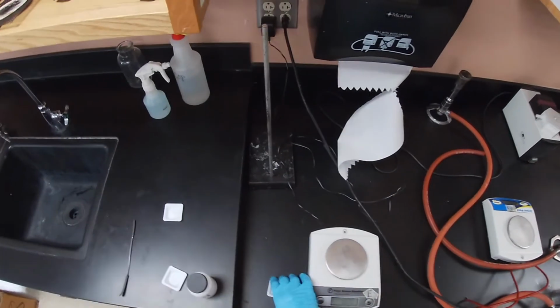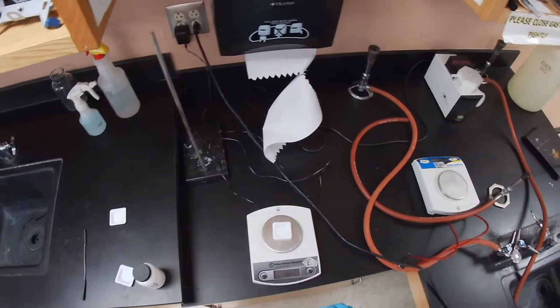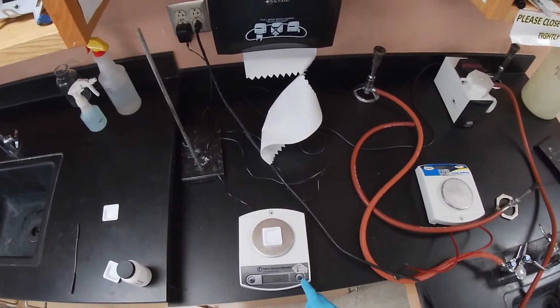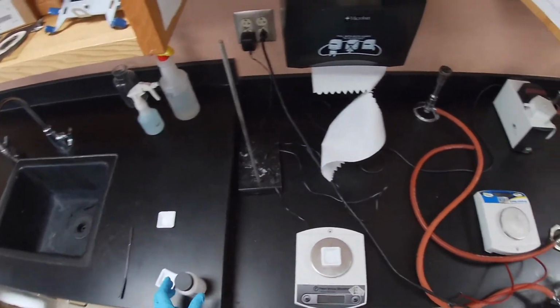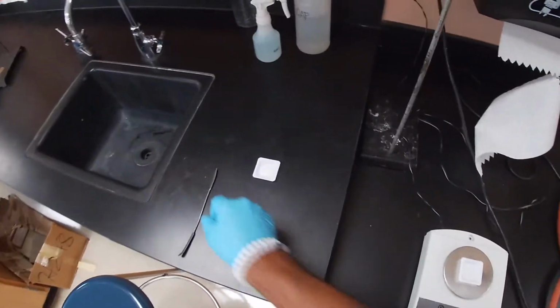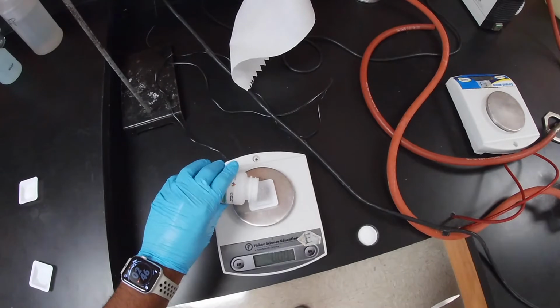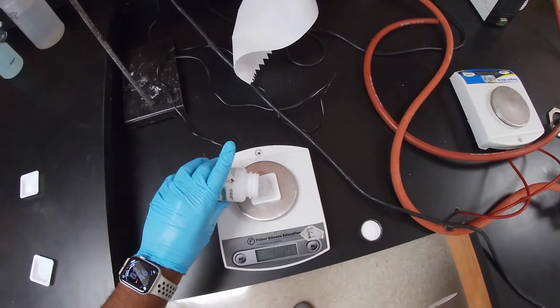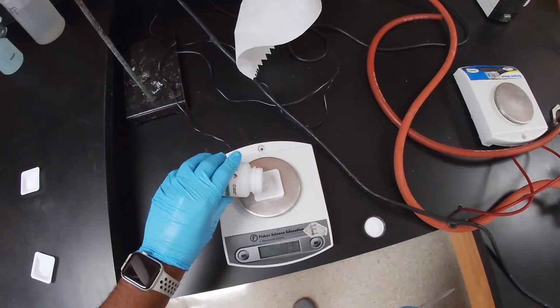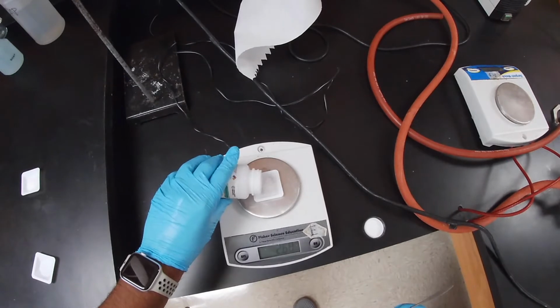Okay, so the next thing we're gonna do is, this one's gonna be 4 grams of the ammonium nitrate. So we're gonna do the same thing. We're gonna kind of center it in the middle, and then we're gonna go ahead and zero it out. And we're gonna go ahead and add our substance, right? And it's gonna be approximately 4. We're just gonna record exactly the amount that we distributed. If slightly off, not a big deal. This one's gonna be 4 grams.